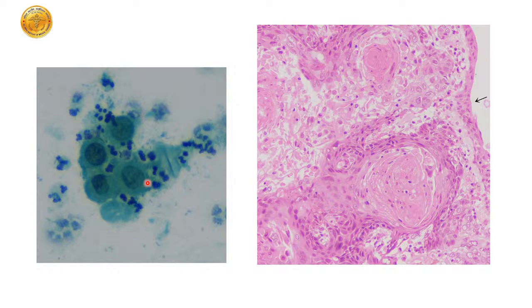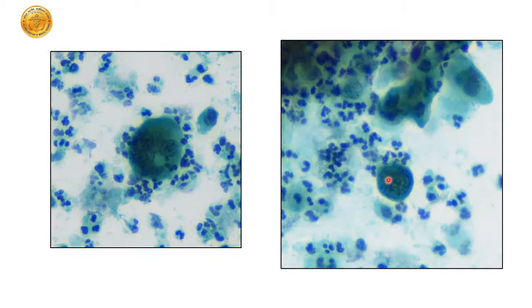But not much hyperchromasia. We just said atypical, and this is what it turned out to be. We had urothelium, and again we had squamous differentiation of the urothelial cancer. So we missed this one. This is just to show you that these are those cases which cause a lot of problems.